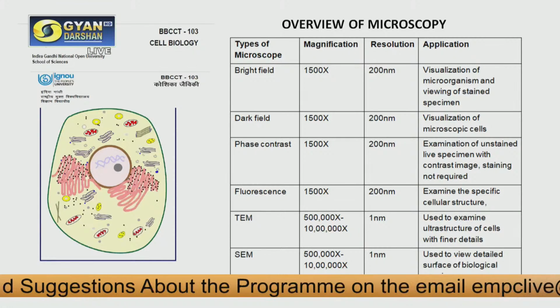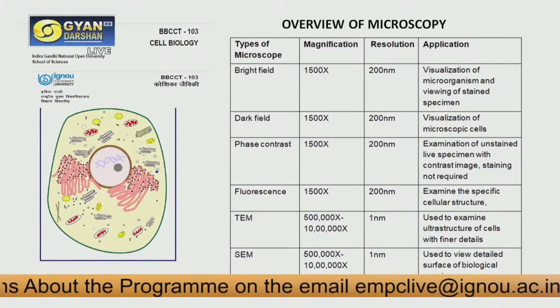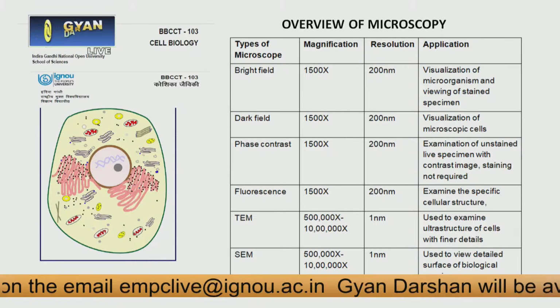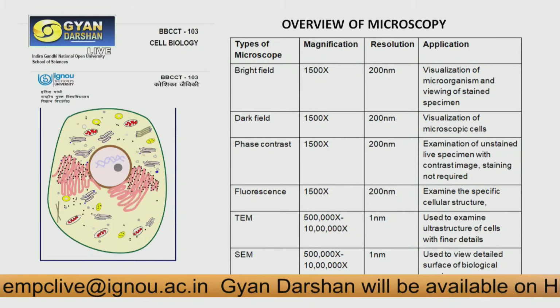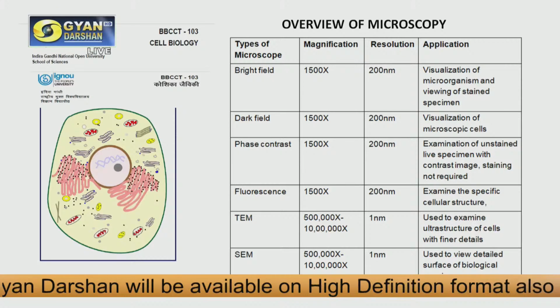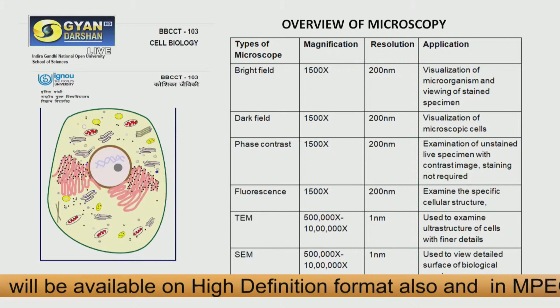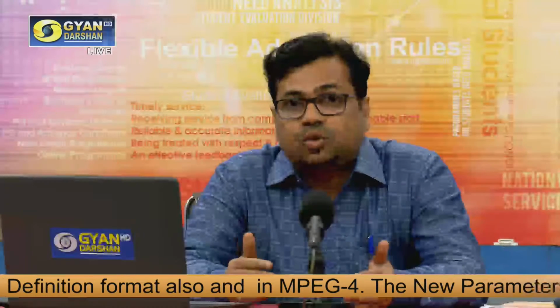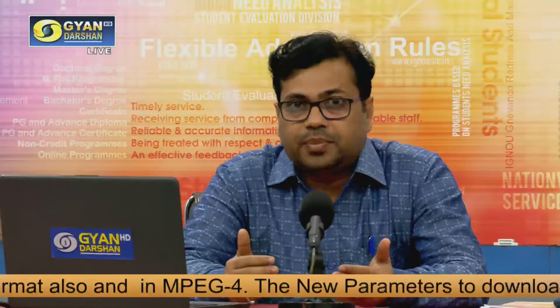These different kinds of light microscopy are used to view different biological specimens, like cells, bacteria and cell structures. Because these cells are tiny, the human eye cannot see them without a microscope. That's why we need a microscope.